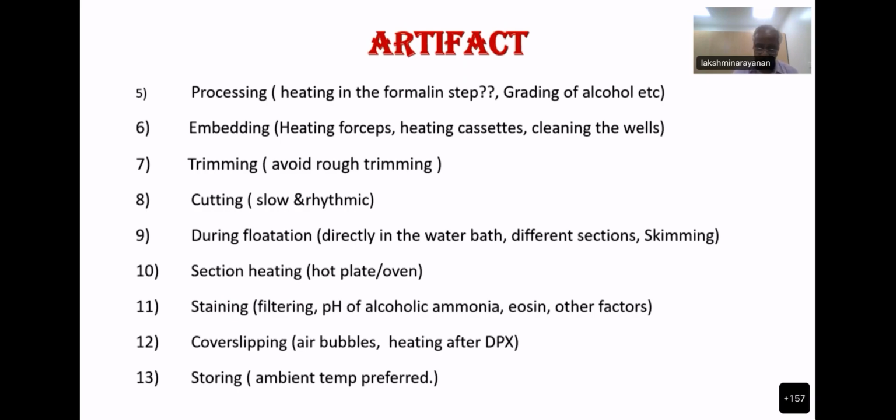Then grading of alcohol in the processor. And at this time, I want to tell that sometimes this artifact will be overcome with some of the troubleshooting also. Both will come hand in hand. Grading of alcohol means again it will affect the processing. It will show some varied result after staining.